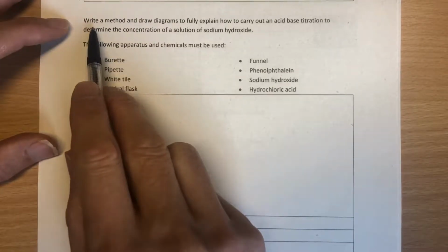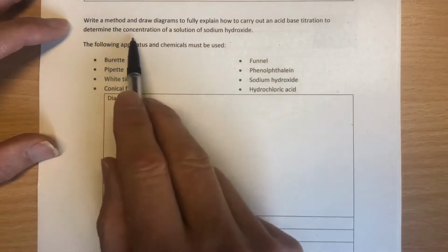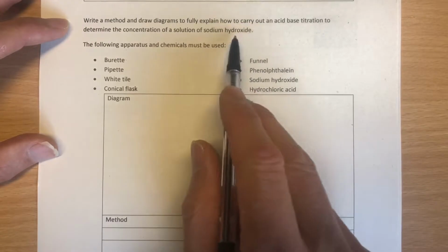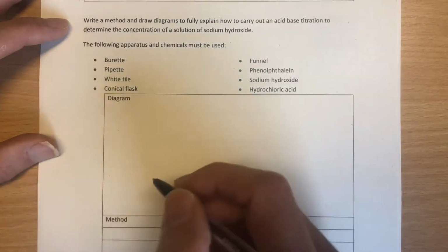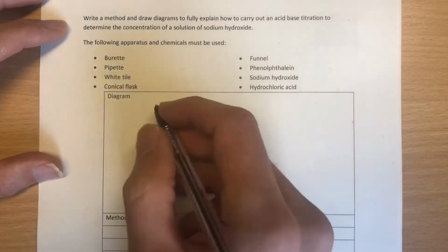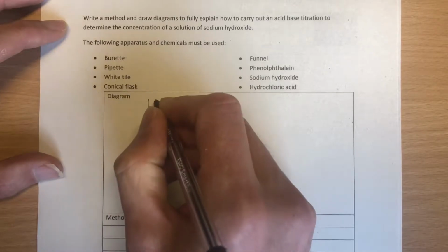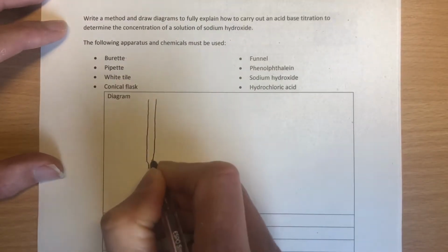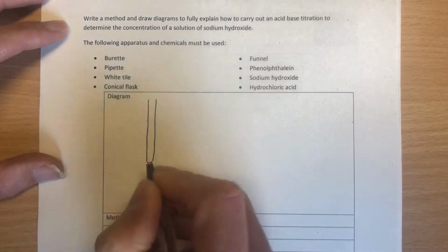So first off, we need to know how to do a titration. Write a method and draw diagrams to fully explain how to carry out an acid-base titration to determine the concentration of a solution of sodium hydroxide. So the sodium hydroxide we do not know the concentration of. The acid we do know the concentration of. What apparatus would we use? Well, we're going to do a titration, as I said. To do a titration, we need a burette. A burette is a very, very long, thin glass tube, like so. And at the bottom of it, there's a tap that will let the acid through drop by drop. So we can show a tap by putting a circle with a cross through it.